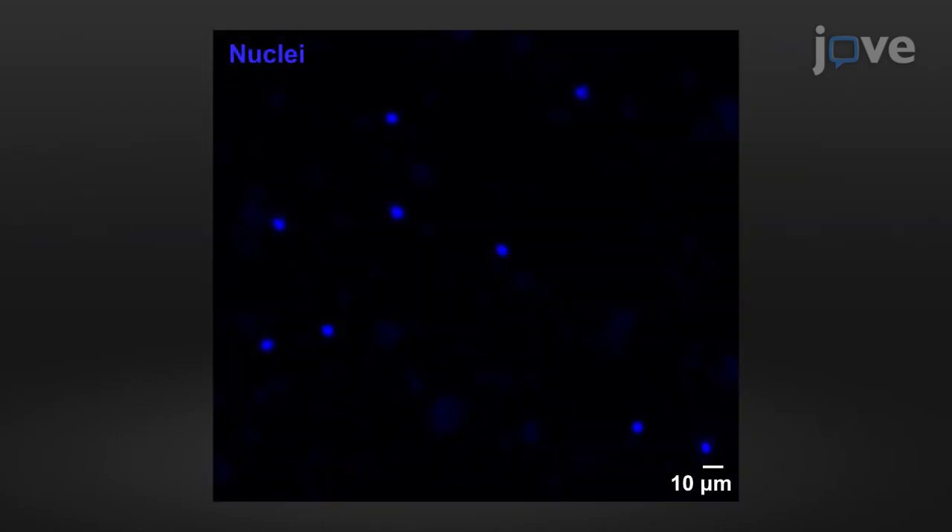This protocol was used to generate single nucleus suspension directly from zebrafish brain tissue. The isolated nuclei were stained with HOECHST and visualized with fluorescence microscopy. They appeared intact, round, and well separated. Importantly, nuclear aggregation was absent.